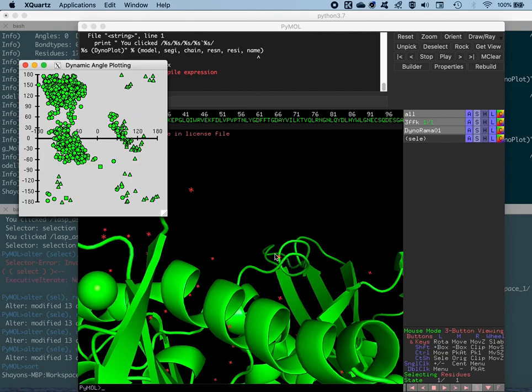So you might ask the question, why is it considered a loop region when you already know that the designated beta sheet region for the other amino acids is basically in this region? As you can see, this particular residue that we selected is slightly an outlier from the designated beta sheet region, which is highly populated around here. So the red region is around here, followed by the yellow region. So this lies somewhere around this region, slightly away from the designated beta sheet region, so occupying this loop region.